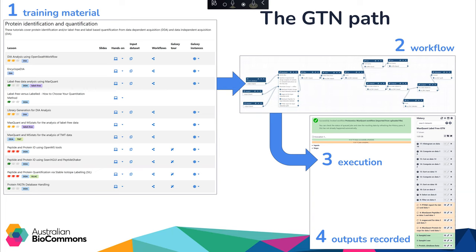Here you can access the hands-on training guides, input datasets and workflows which you can import and execute on Galaxy Australia, at which point the data, tools and settings used are recorded in your Galaxy history.